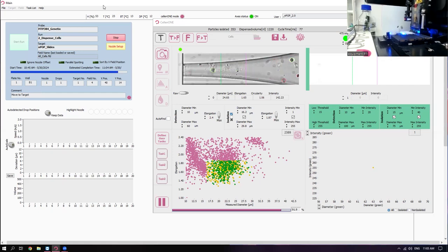Around 300 picoliters. We have smaller nozzles, which are good for smaller particles. I'd say if we're going to do nuclei, it's a little bit more deterministic of the small nuclei, certainly of bacteria or viral particles. You want to run with a smaller nozzle. That'll run around 150 or 200 picoliters. And then for the large nozzles for doing kind of cardiomyocytes, astrocytes, these kind of large particles, you're going to run around 500 or so picoliters.